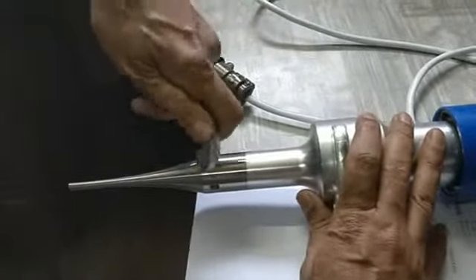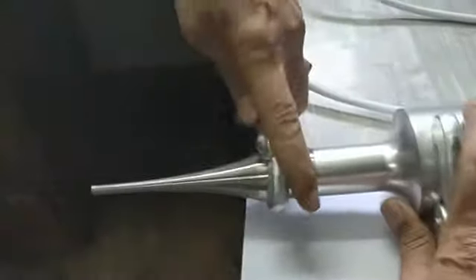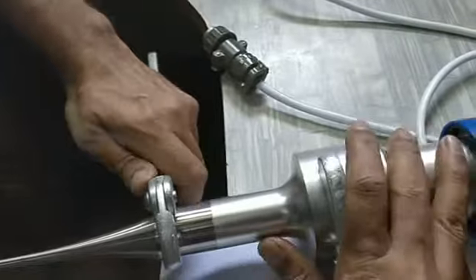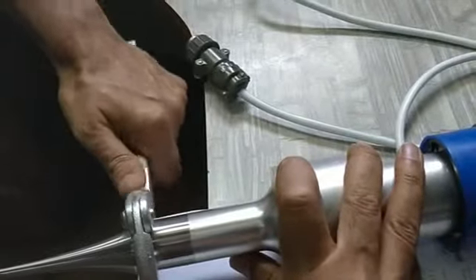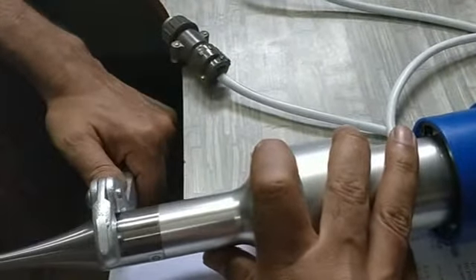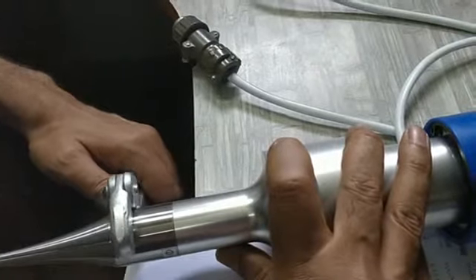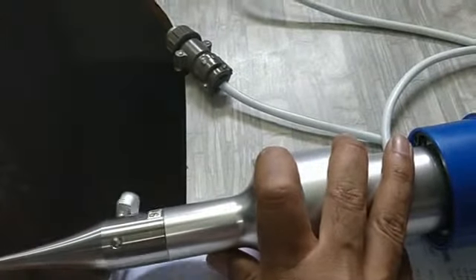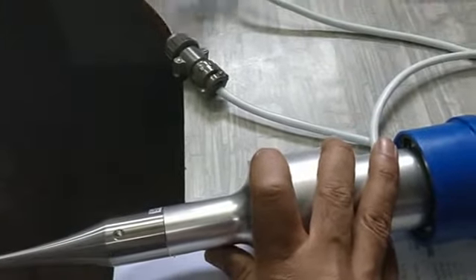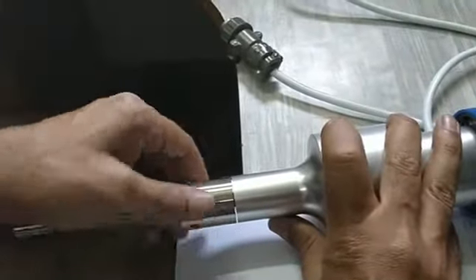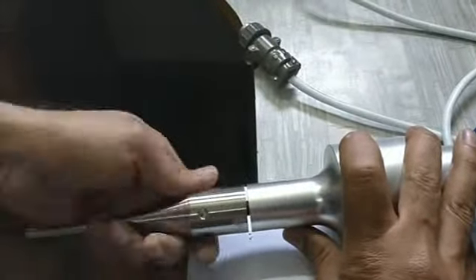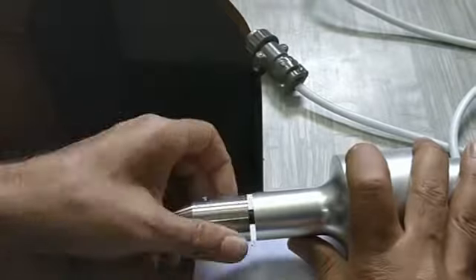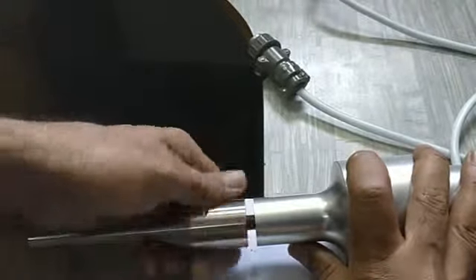To open the probe, we will have to fix the smaller tool like this and move it anticlockwise. Initially this may be a little bit tight. With the help of the tool, we will make 2-3 turns, and after that you can easily take it out by hand only.